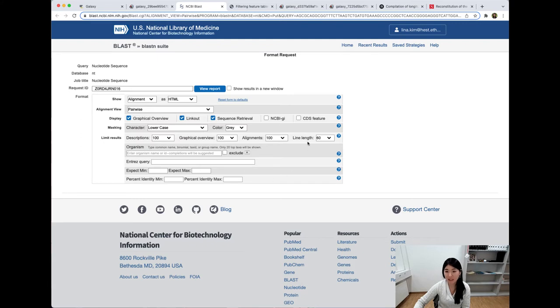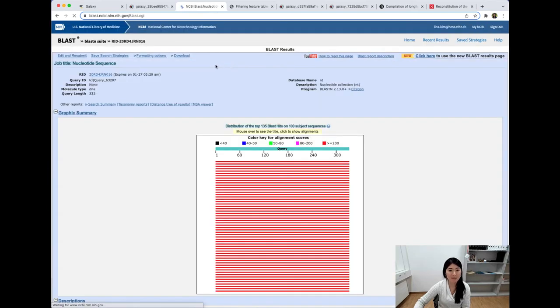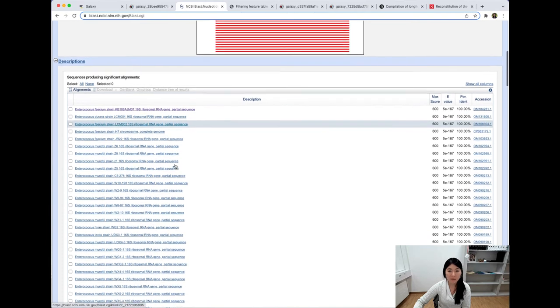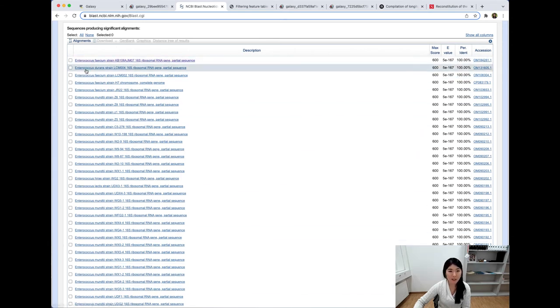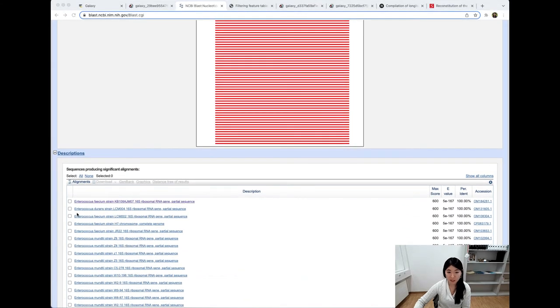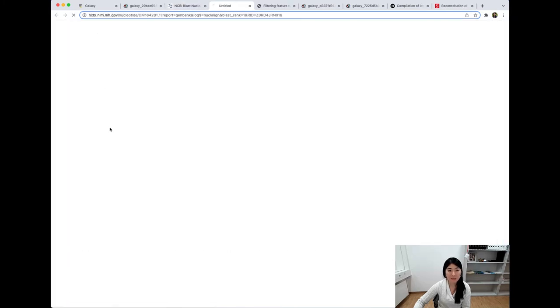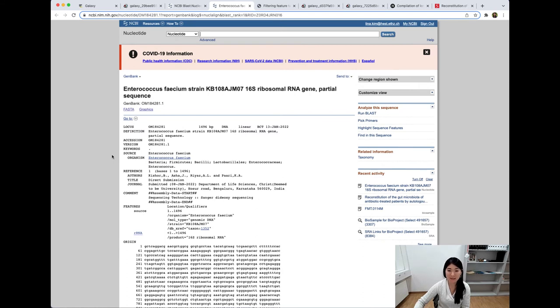This 332-nucleotide sequence — we can align that against all these different genomes of all sorts of different organisms and get a better idea of where this nucleotide sequence came from. You can play around with parameters, decide which organism you want to search in, and click view reports to send in the request. Wow, that was fast — it finished. We see the best matches to that particular nucleotide sequence are all to different Enterococcus strains, which is pretty consistent. If you're curious, you can click on some of these links, take a look at the alignments, and even look at what GenBank says about this particular sequence.